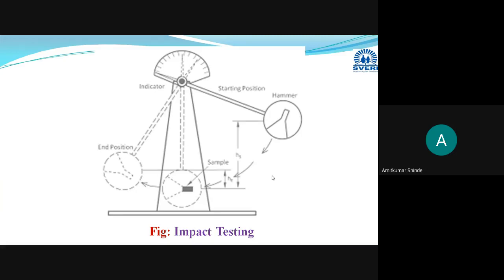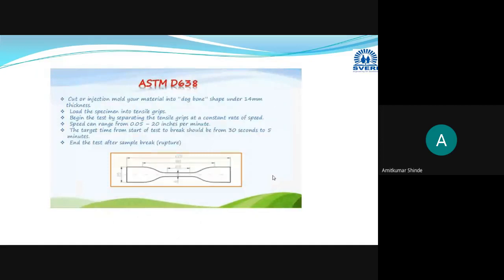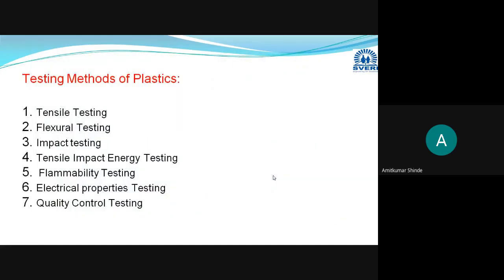Okay, tensile impact energy, and we will be able to measure the impact strength of that particular specimen with the help of tensile impact energy testing. Okay, in this way we have completed four testing methods. Okay, I will summarize this. We have completed the four testing methods.